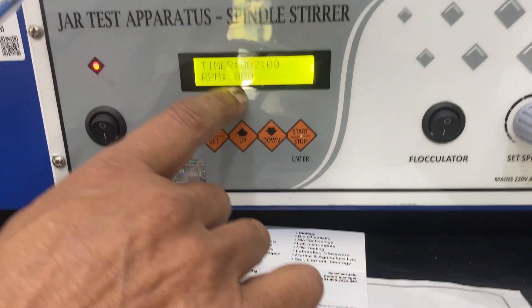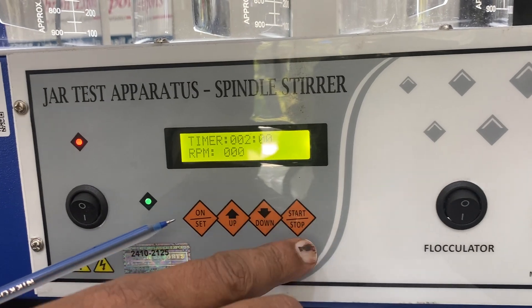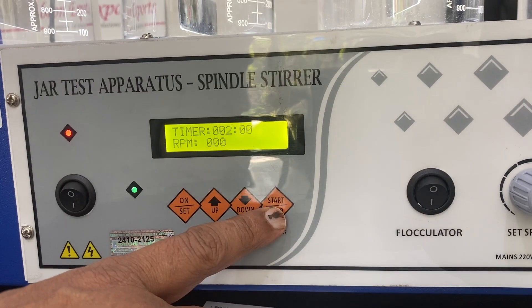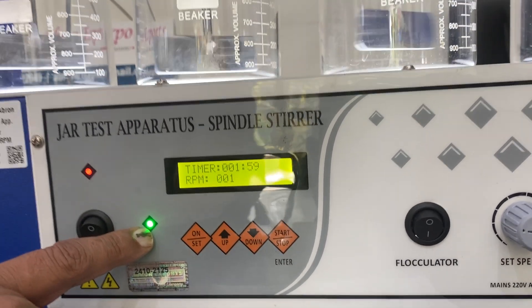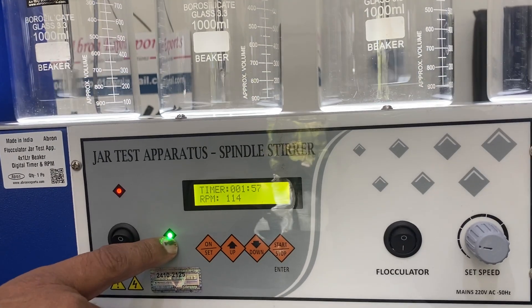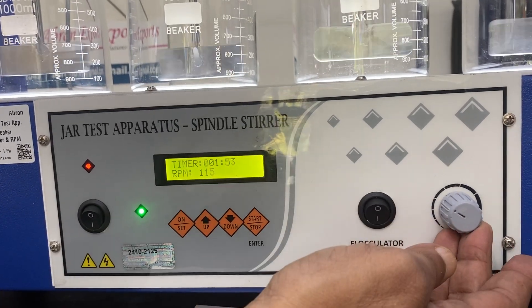The display shows a welcome message and then shows the timer — default is two minutes — and the RPM is shown here. If I want to start it, I just push this button. The indicator tells you it is working and the speed shows 115; I can increase it.